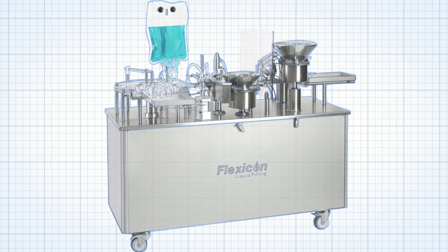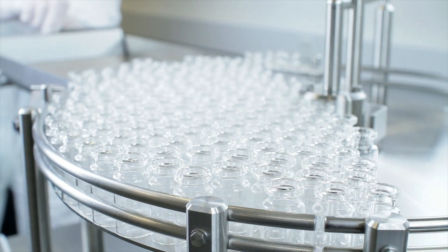Flexicon's FPC-50 is a highly flexible, compact, automatic aseptic filling system.